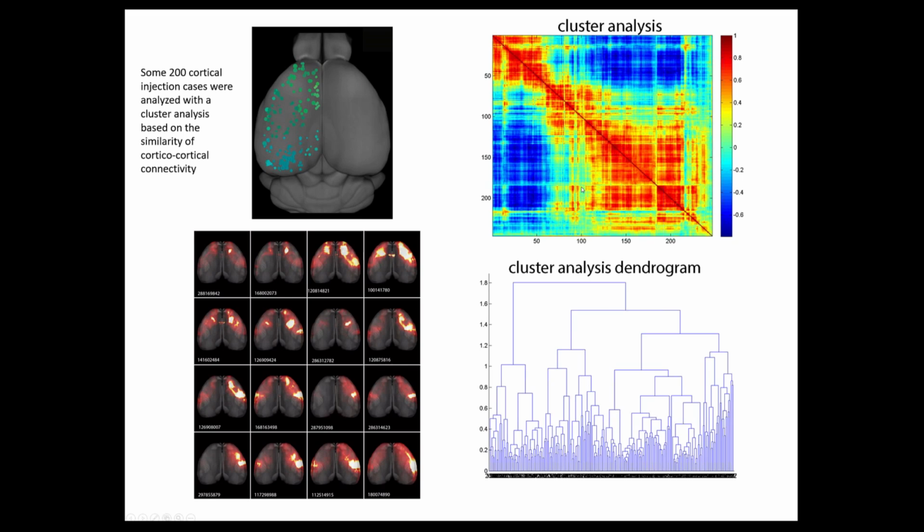So this approach, in my view, as a long-standing anatomist, really revolutionized the ability to quantify the connections within the brain.